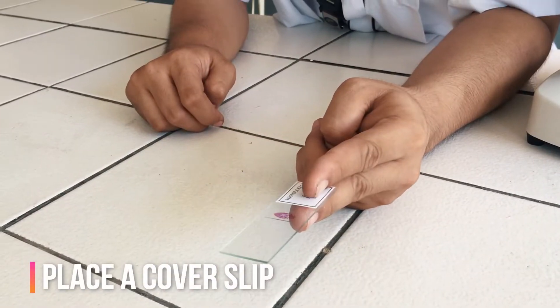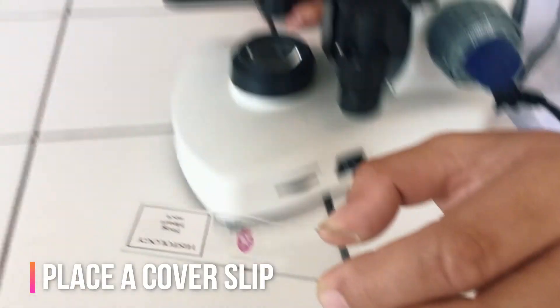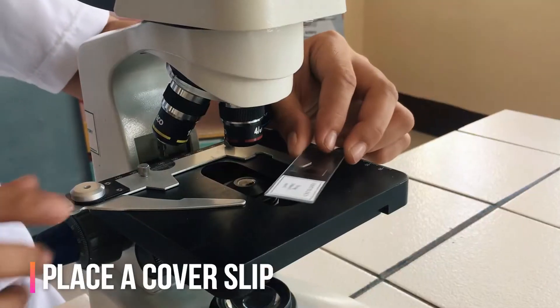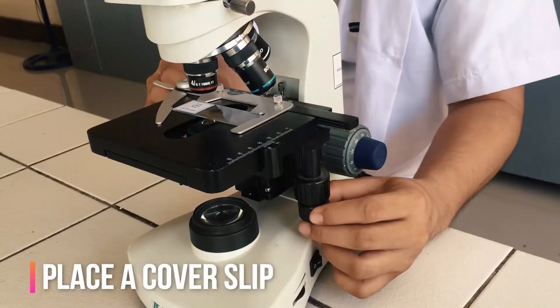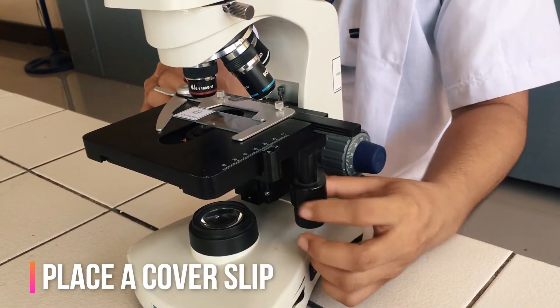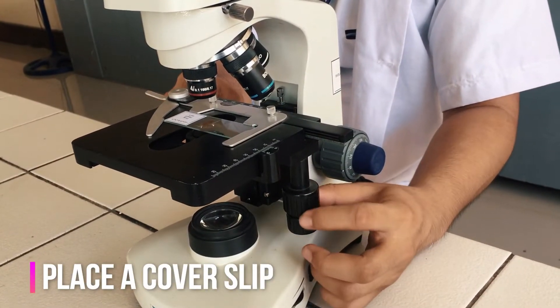Your microscope slide should be prepared by placing a cover slip or cover glass over the specimen. This will help protect the objective lenses if they touch the slide. Place the microscope slide on the stage and fasten it with the stage clips.